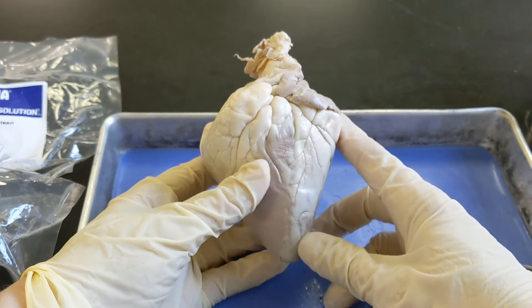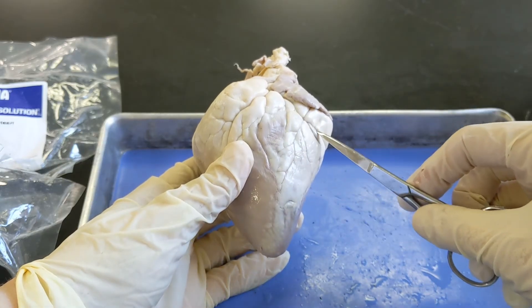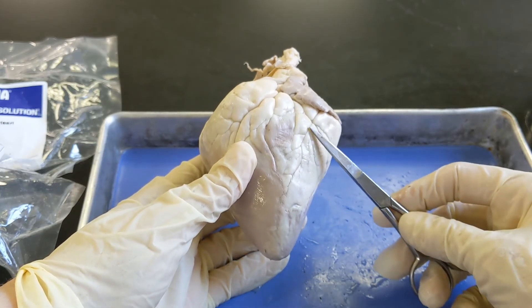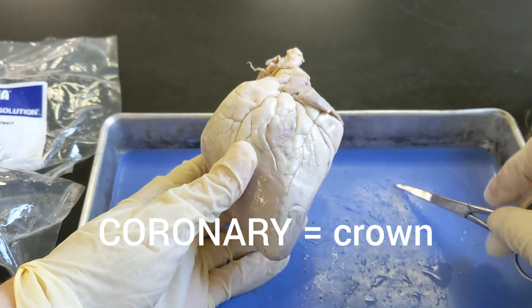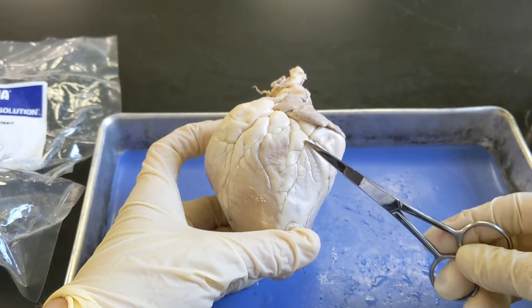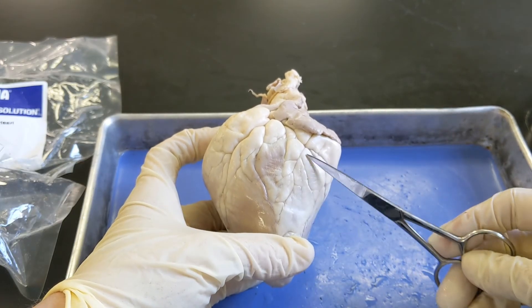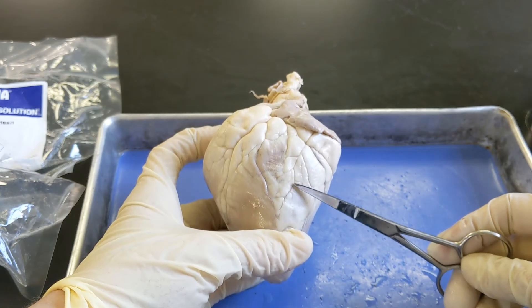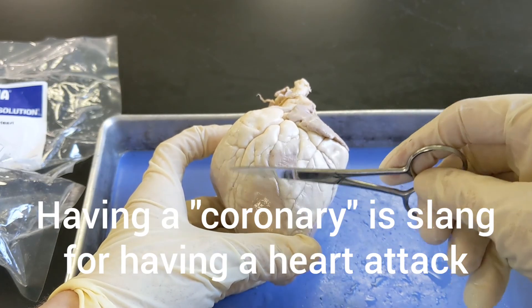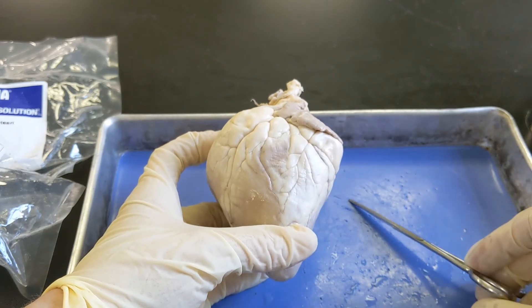That covers the external anatomy of the heart. We also have the coronary arteries, which are really important. Coronary, just like corona, comes from the Latin word for crown — they're called coronary arteries because they're thought to look like a crown or wreath around the heart. You have several coronary arteries on your heart. The coronary arteries branch off of the aorta and bring oxygenated blood to actually feed the heart tissue — oxygen and nutrients to feed the heart tissue. If someone has a heart attack, this is where the blockage is: in one of the coronary arteries. If they get blocked, the heart tissue that's not getting oxygen or nutrients will die.